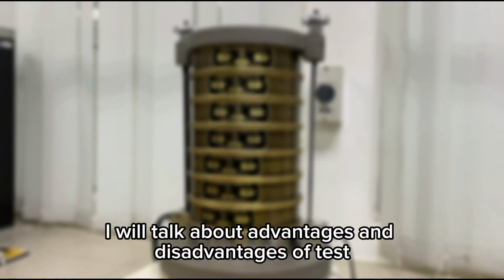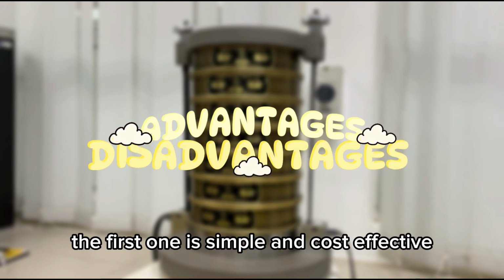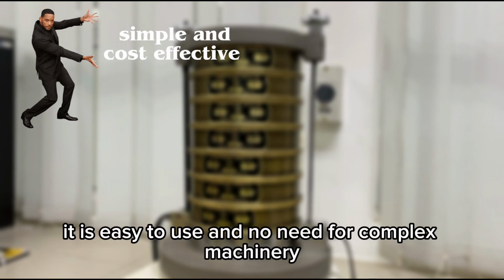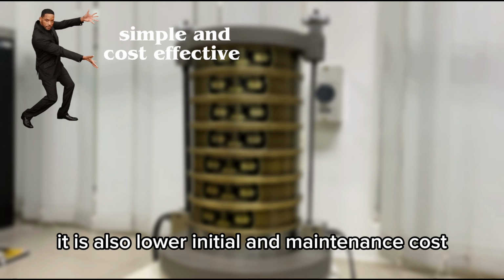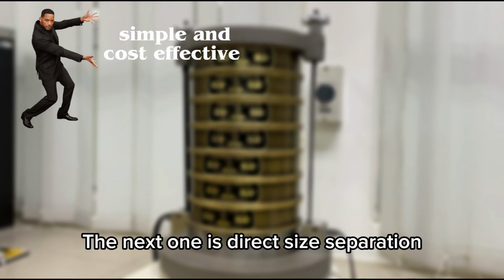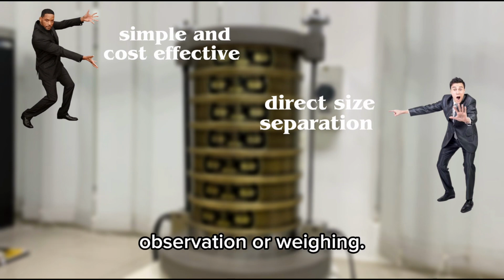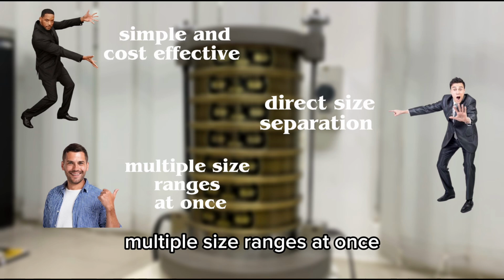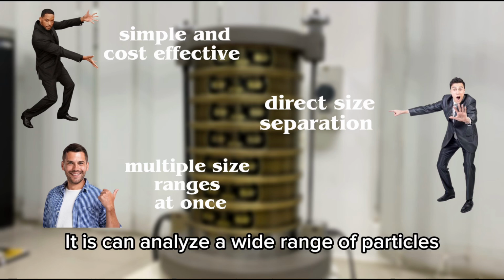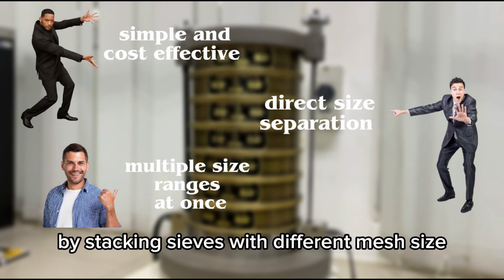Now, I will talk about the advantages and disadvantages of the test sieve stack. For the advantages, the first one is simple and cost-effective. It is easy to use and there is no need for complex machinery. It also has lower initial and maintenance costs compared to laser diffraction or other particle sizing equipment. The next one is direct size separation. It provides clear separation of particle size fractions for physical observation or weighing. And the third one is multiple size ranges at once. It can analyze a wide range of particle sizes simultaneously by stacking sieves with different mesh sizes.